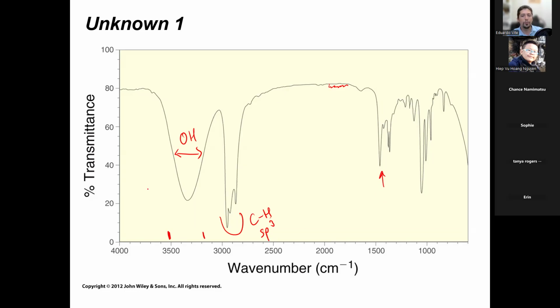It's not always at 20%, but it's definitely lower than 40, like 30. Usually it's strong. You will definitely be able to tell. It also just looks like a parabola. It's very distinctive. It's hard to get it confused with something else once you start really seeing the examples. And at the end of the presentation, I'll show you where you can find examples so you can practice on your own.